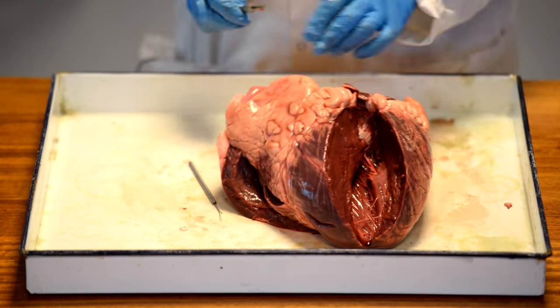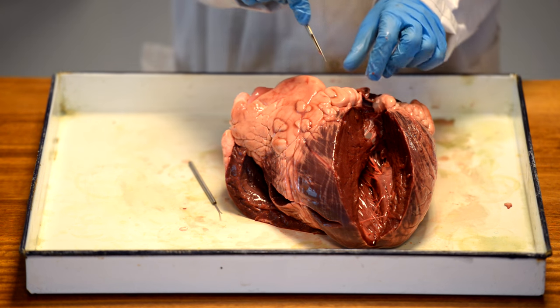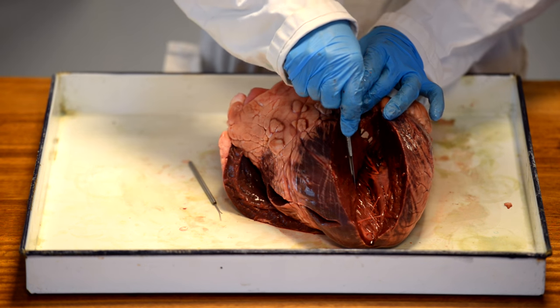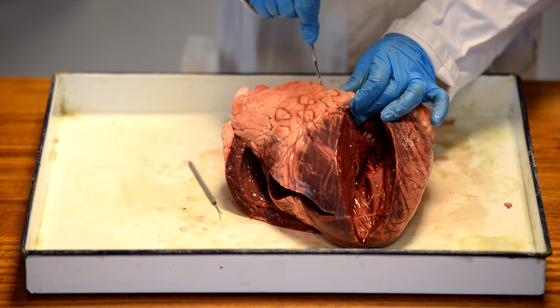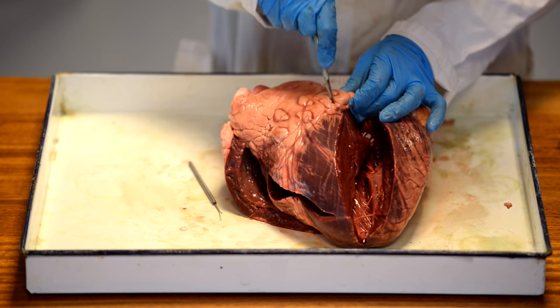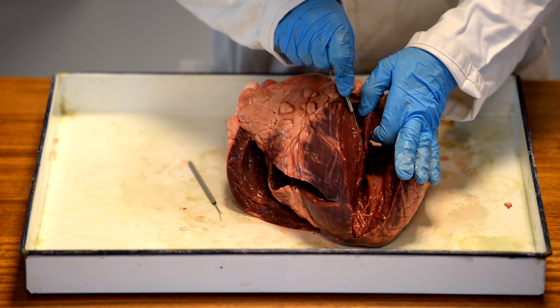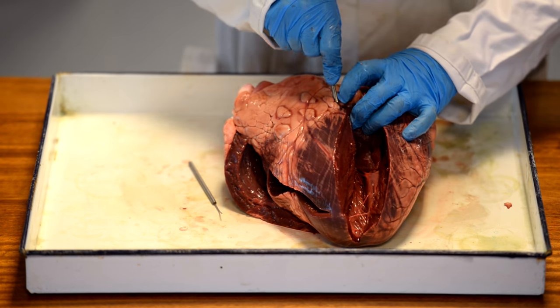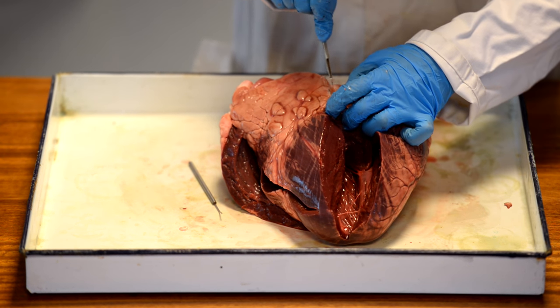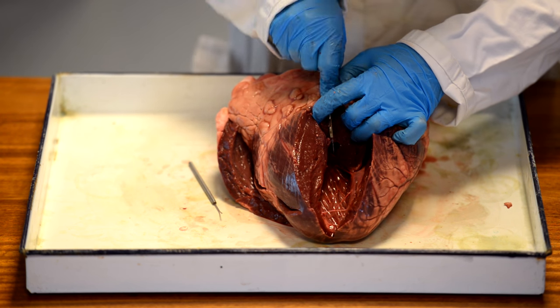Now, it's going to take a little bit of effort for me to cut away all of this flesh so we can open up the aorta. Let's take a slightly better line than the one I did and let's cut through all of this. So, nice healthy little cow, lots and lots and lots of fat. Try not to hack it, just stroke this flesh away. That's it. A little bit wider. Pull it gently apart and I'm heading for the aorta.